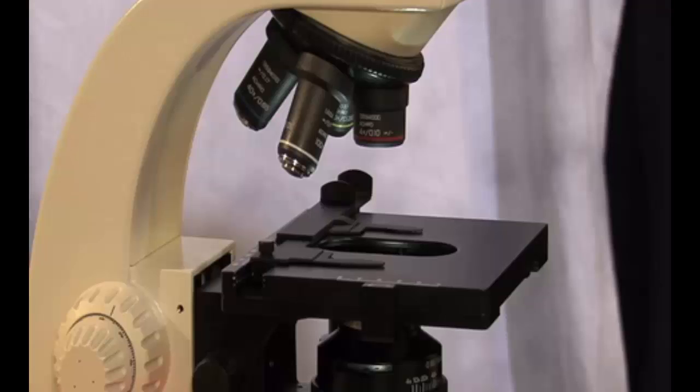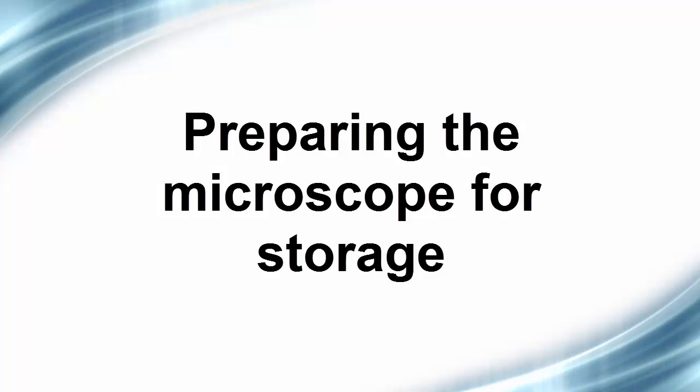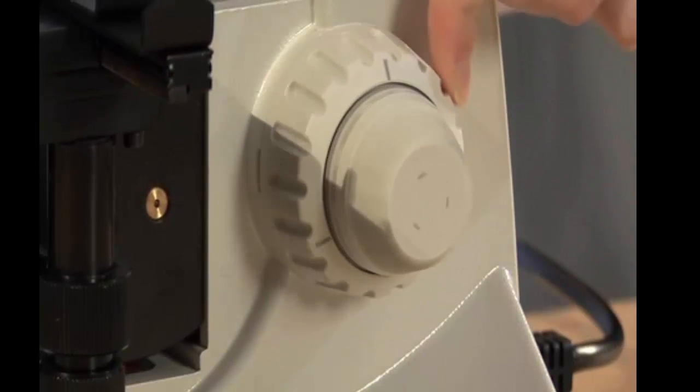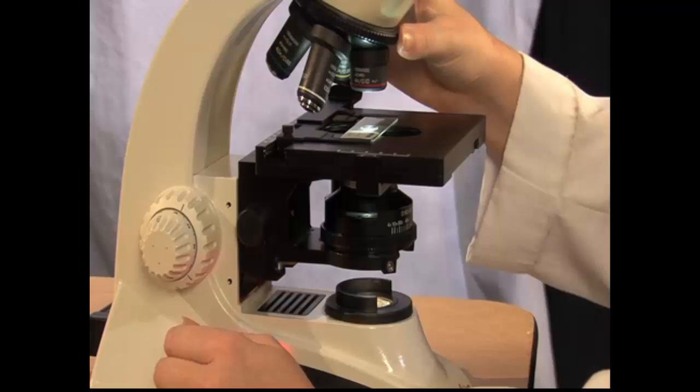You are now ready to select another specimen and start viewing it. When you are finished using the light microscope, you will need to prepare it for storage. Use the coarse adjustment knob to lower the stage to its lowest position and then rotate the objectives back to scanning power.